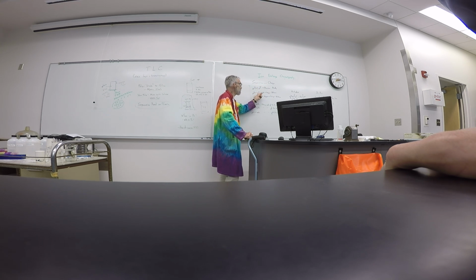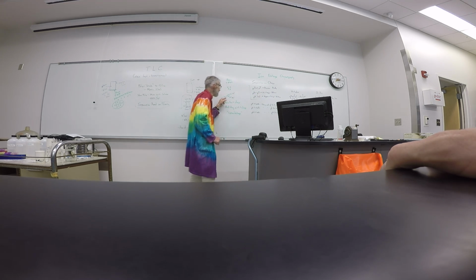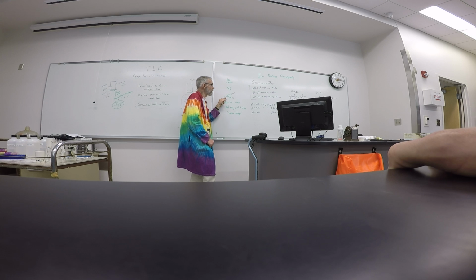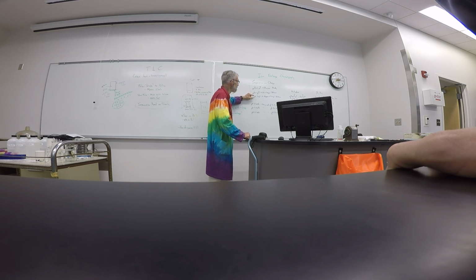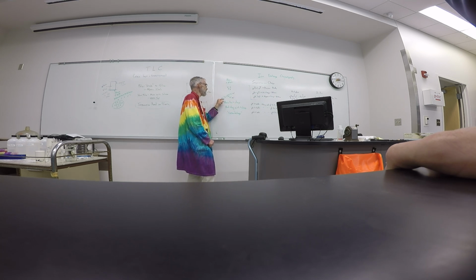When pH is equal to pI, we just talked about that yesterday, what happens? It's neutral. And if it's neutral, and this guy is binding things that are only positive, that guy will start to come off. And if the pH is greater than the pI, then you have a negative charge, and that will definitely come off because it's not even attracted to the column at all.